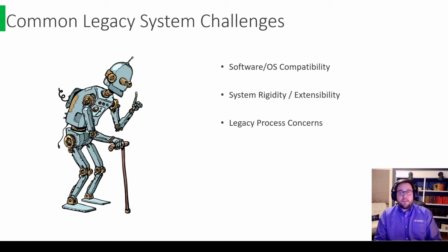So the first thing I think we need to look at is the past, which is your current experience or previous experience with a system that has now found itself at a crossroads. The biggest crossroads we usually find with these systems is the move from Windows 7 to Windows 10. Now, since Windows 7 isn't supported by Microsoft for security updates anymore, if you have any automation systems that are running on that, it's unlikely that your IT will allow you to connect to your organization's network anymore. And this is obviously very important for connecting to databases, LIMS, all kinds of things.